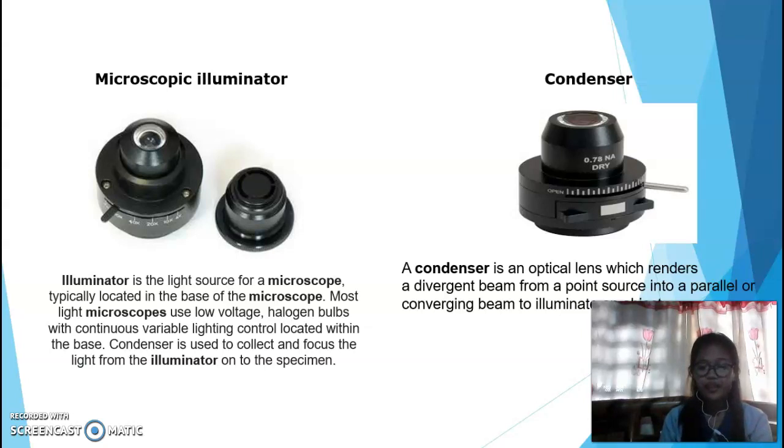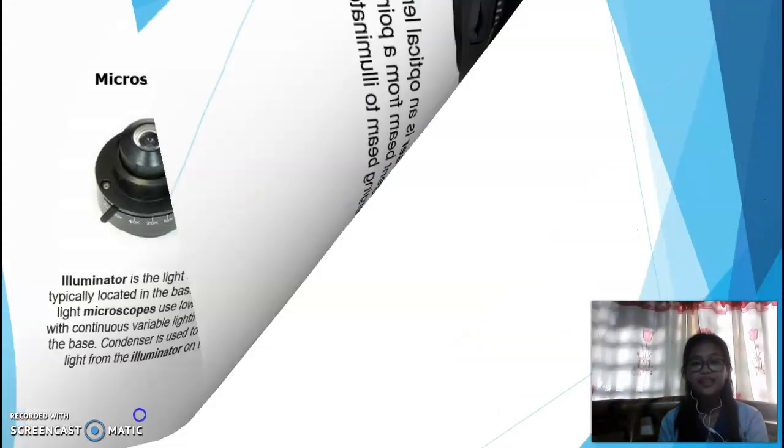They play a major role in ensuring clear, sharp images are produced at a high magnification of 400x and above. The higher the magnification of the condenser, the more the image clarifies. More sophisticated microscopes come with an Abbe condenser that has a high magnification above 1000.